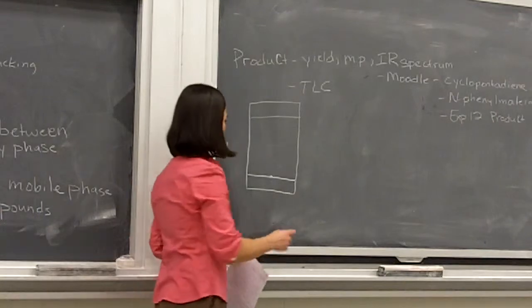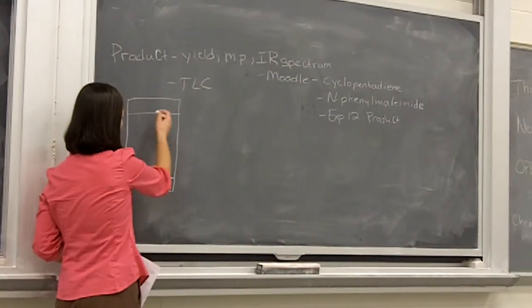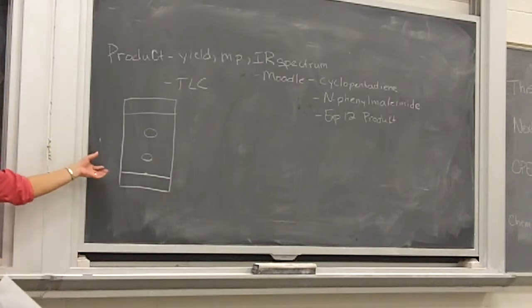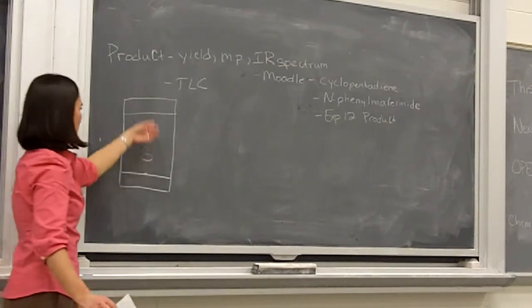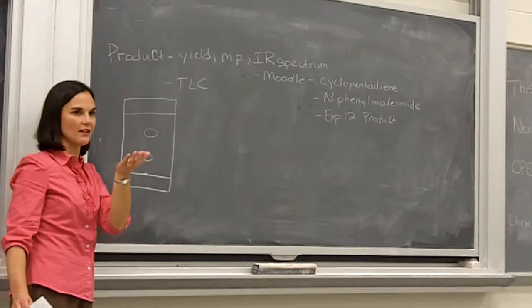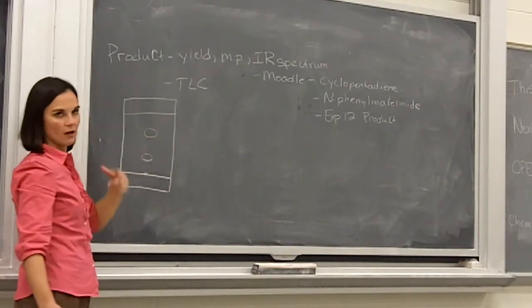as well, okay? So we've developed this TLC plate, and if we had multiple compounds on here, so we've got something like this, like this. Once you're done developing it, you're going to take this TLC plate and look at it under UV light, because the TLC plates have this dye in them that reacts with compounds that are on the silica, and when you look at the TLC plate under the UV light, you'll be able to see where UV active compounds are, okay?